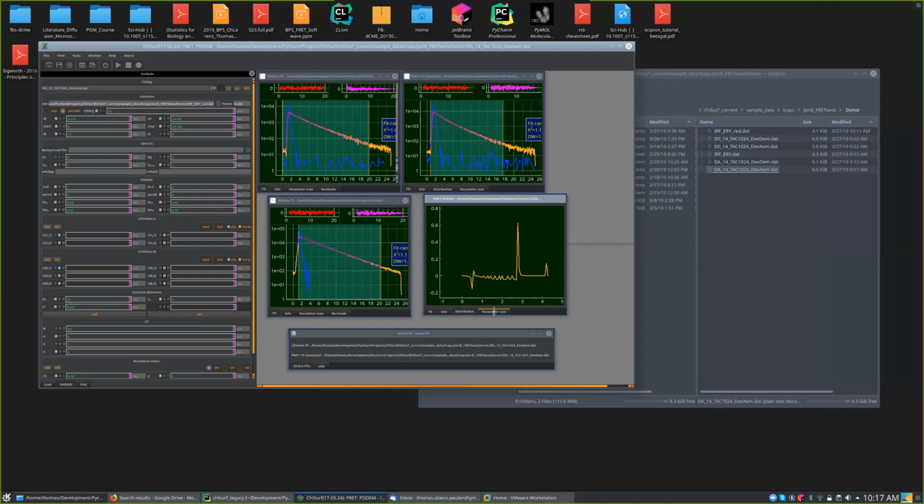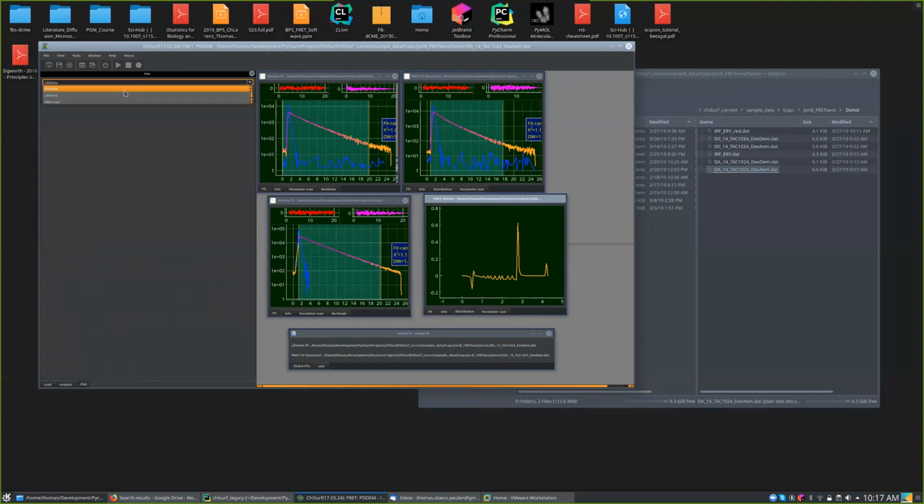Okay, so let's go back here. But this would mean that if we use the FRET sensitized model here, this PDDEM fit, we don't end up with a distribution. No, you get a distribution. You optimize a Gaussian distance distribution against your data, but internally this Gaussian distance distribution is represented by a set of FRET rate constants that is converted with the lifetimes you have in your model to a set of lifetimes. Okay, got it. So these distances are converted to FRET rate constants, and then the FRET rate constants are converted with the lifetimes you have to lifetimes that are optimized against the data.